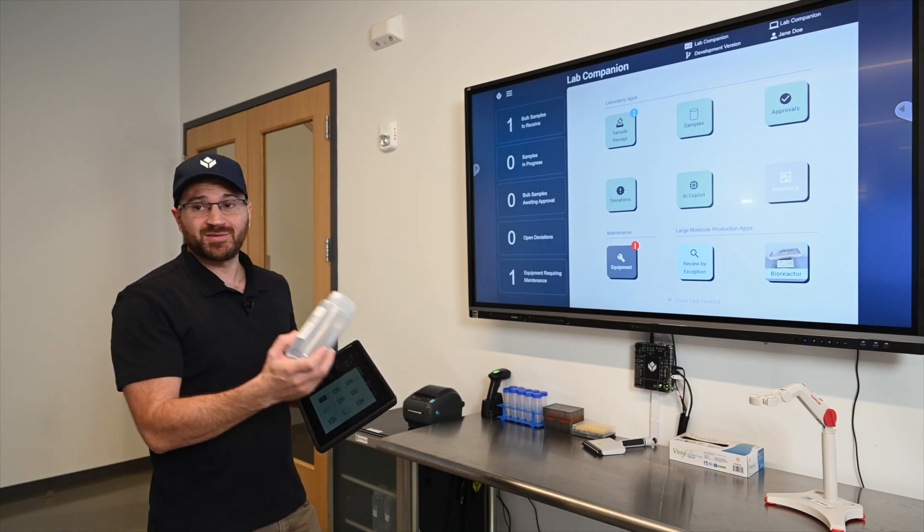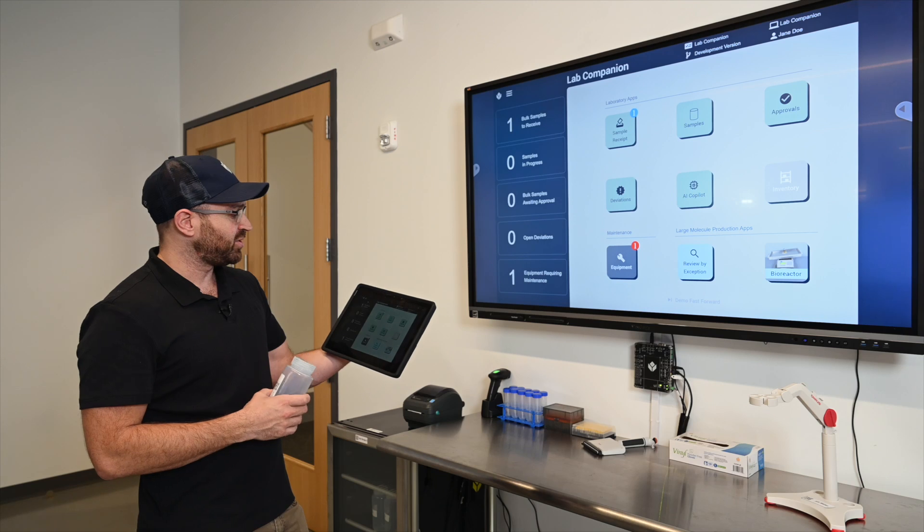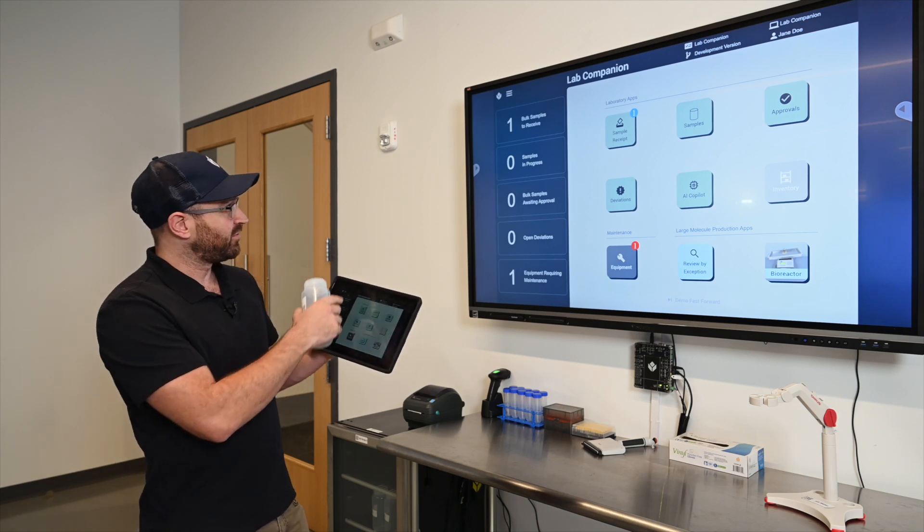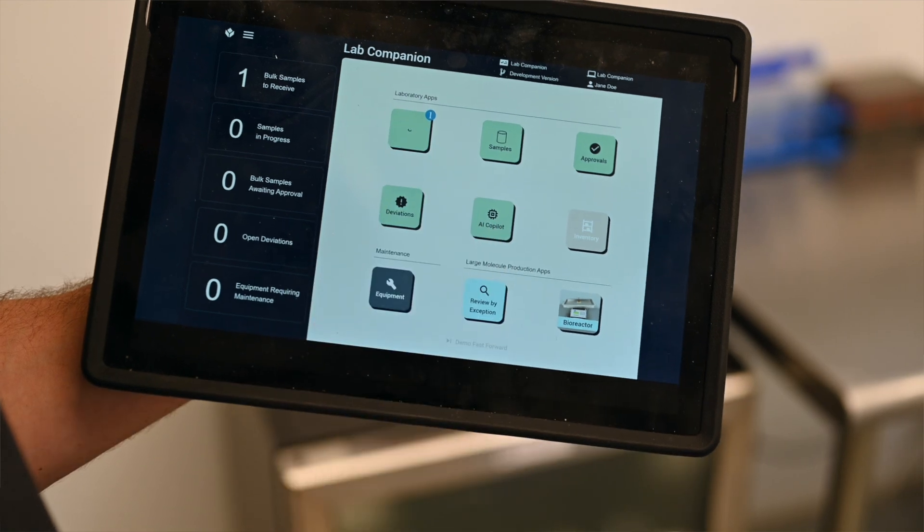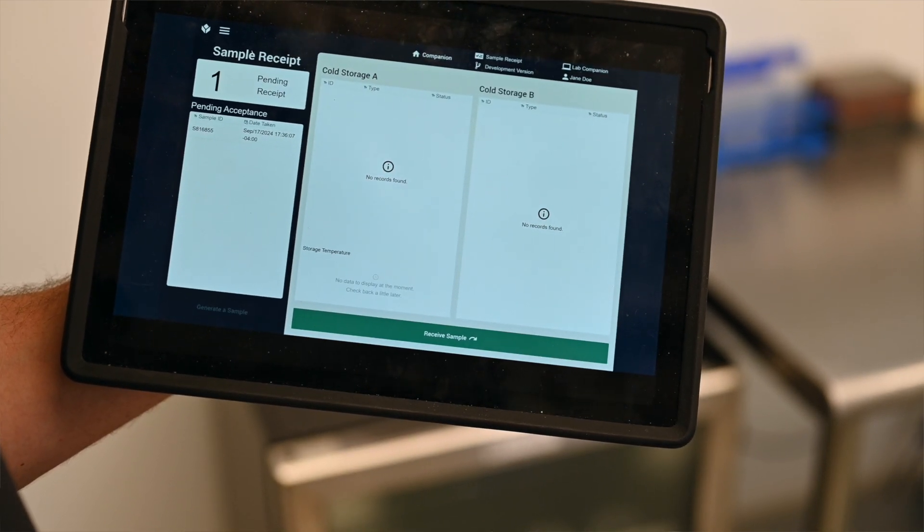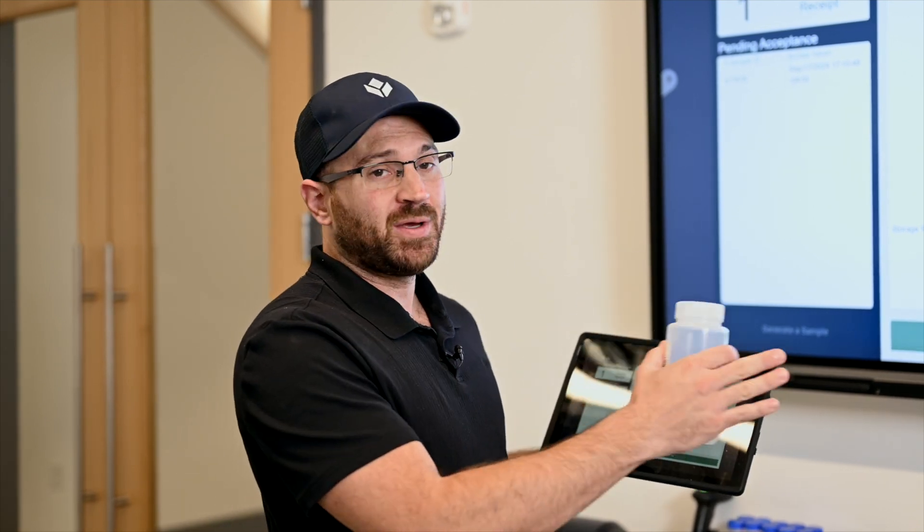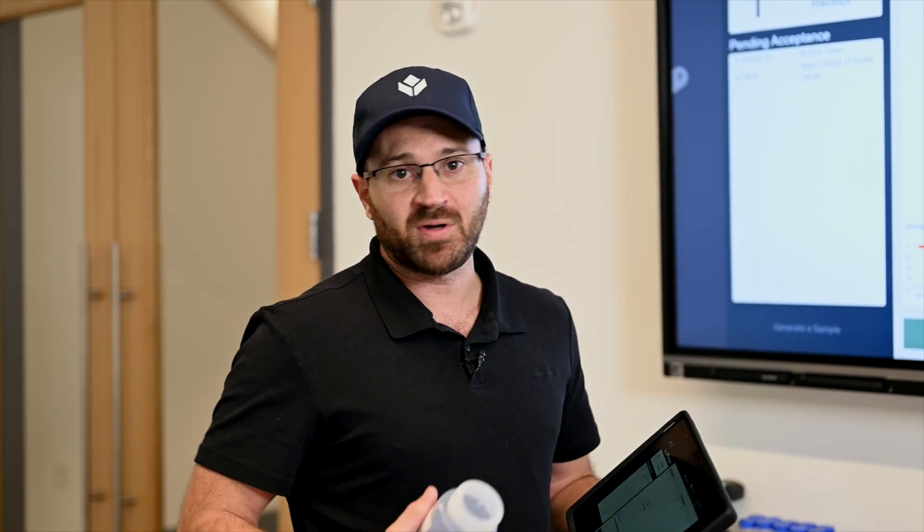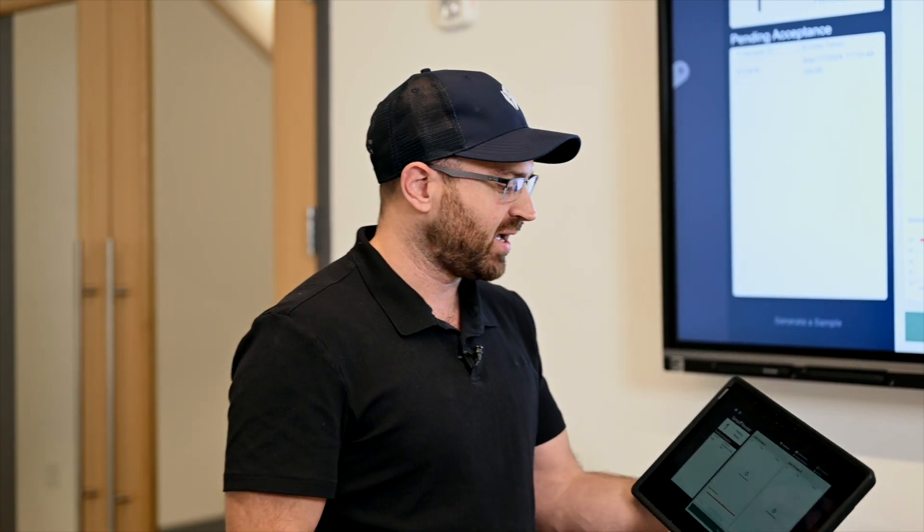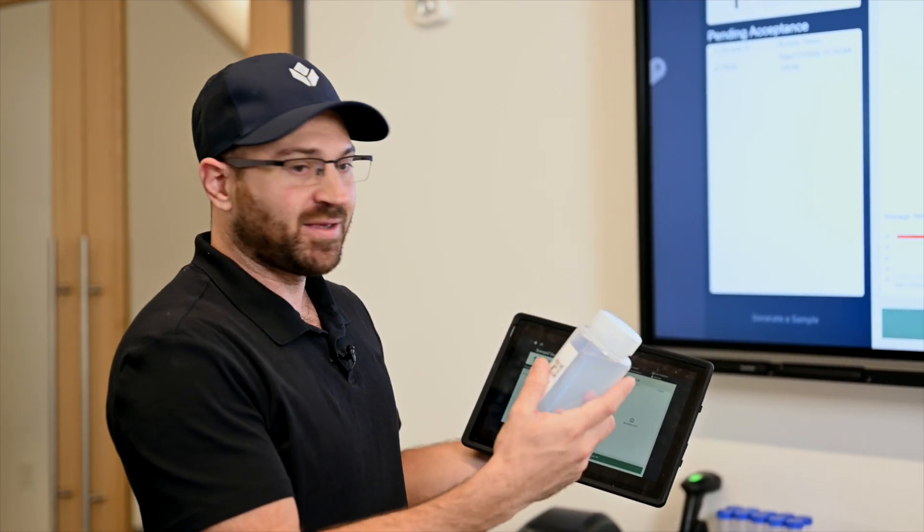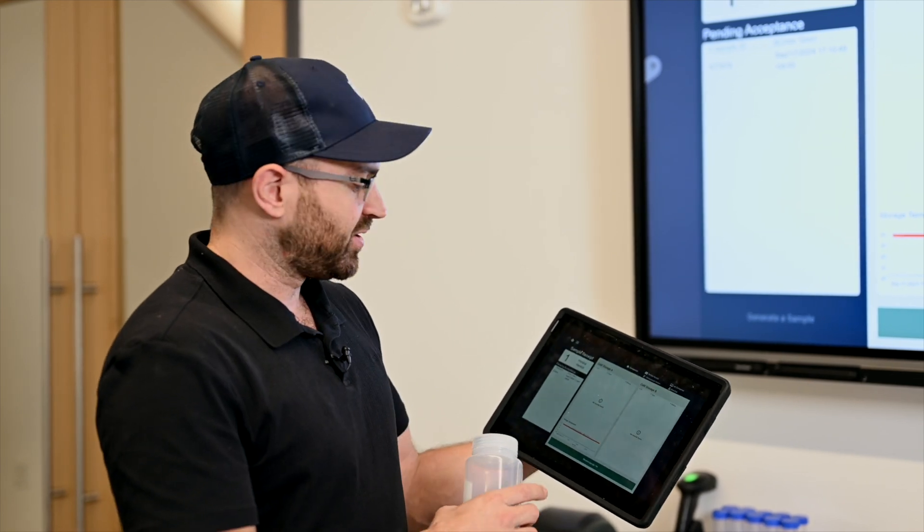To do that we're first going to receive this. If you look at the lab companion you can see we have one sample to receive as indicated by the notification. As sample management personnel I'm going to open up this lab receipt application. We're going to be jumping between different applications and taking on different personas, so I'll make sure I describe what I'm doing and who I'm supposed to be at that time.